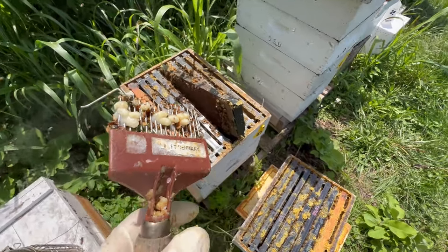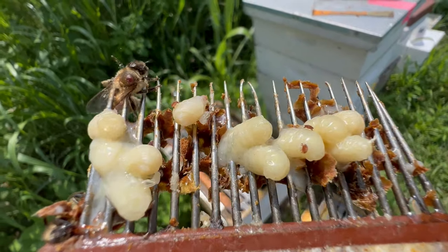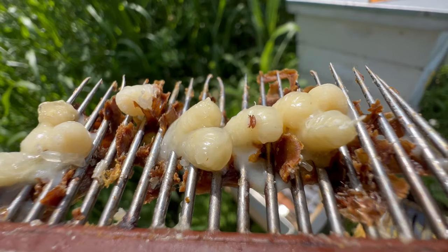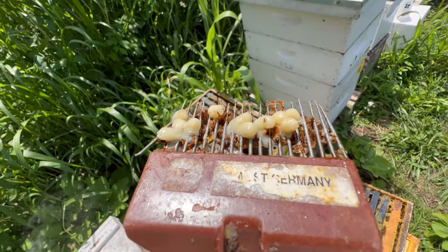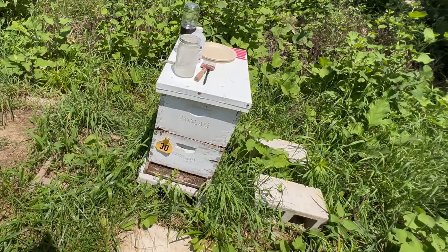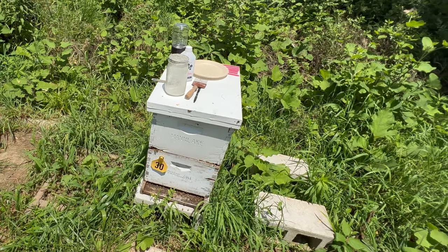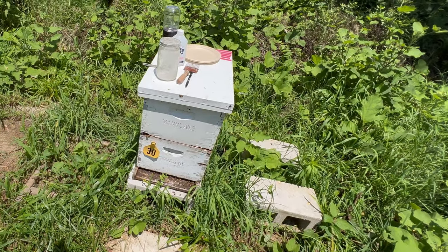I just pulled a sampling of drone brood from Hive 45, and it doesn't even take a magnifier to see that there are varroa inside of those. So let's perform our alcohol wash test and see how bad the infestation is. I will be using the testing protocol recommended by the Honeybee Health Coalition, and I will place a link to their Tools for Varroa Management guide in the text below.